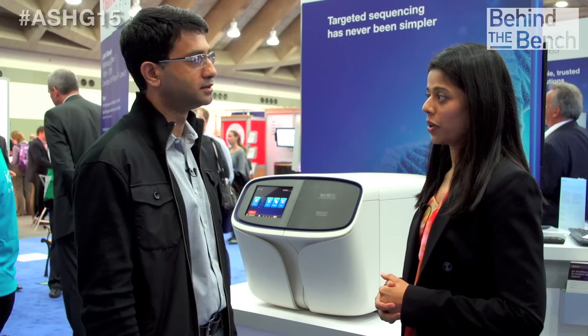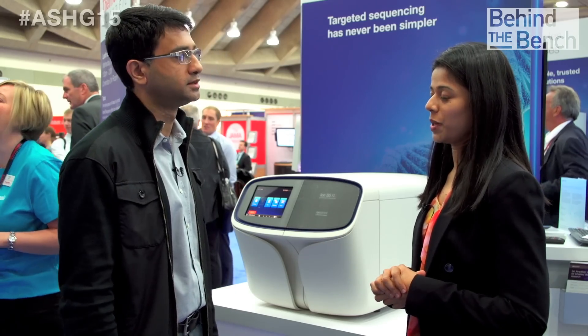Now that we have automated library prep on the Ion Chef system, customers moving from a manual library prep workflow to the automated workflow are wondering how they know what kits to order. If you're going to switch from OneTouch2 to the Ion Chef, you can go to thermofisher.com/IonS5 and find any compatible kit on the product selection guide, which will have all the information they need.